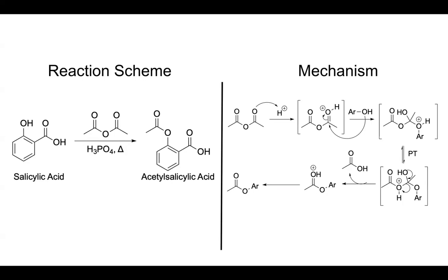A mechanism is the more in-depth arrow-pushing explanation of how reagents become a product. You can include a mechanism in the notes section of your lab notebook, but it is not the reaction scheme that is needed in the pre-lab.